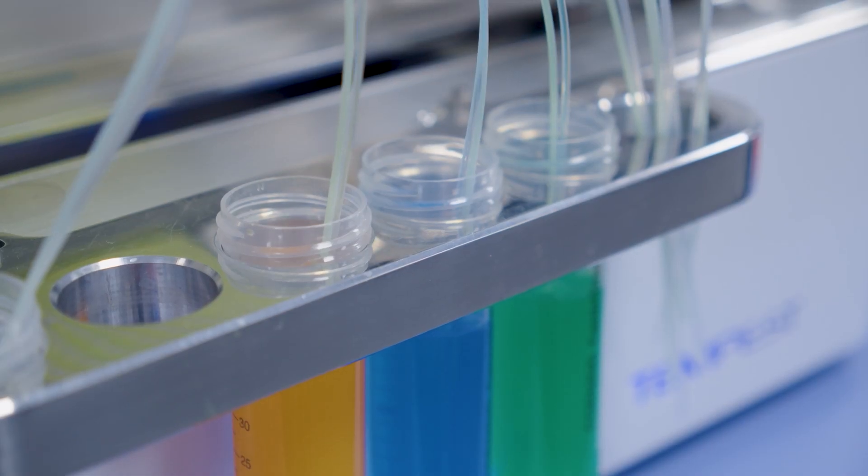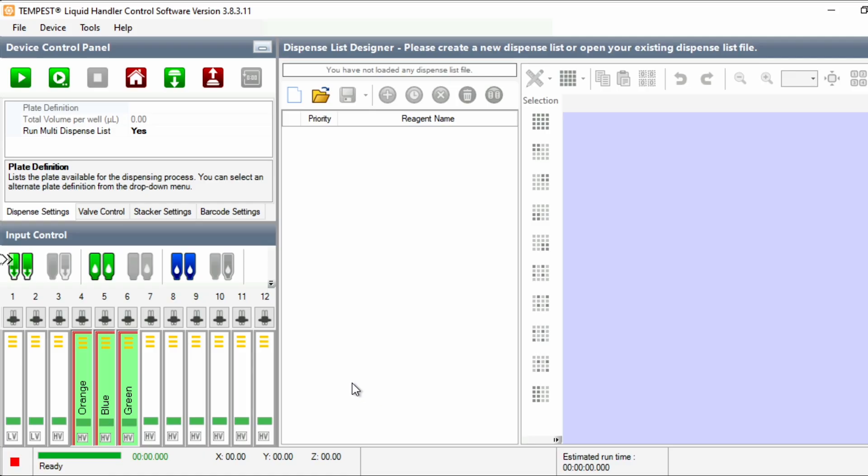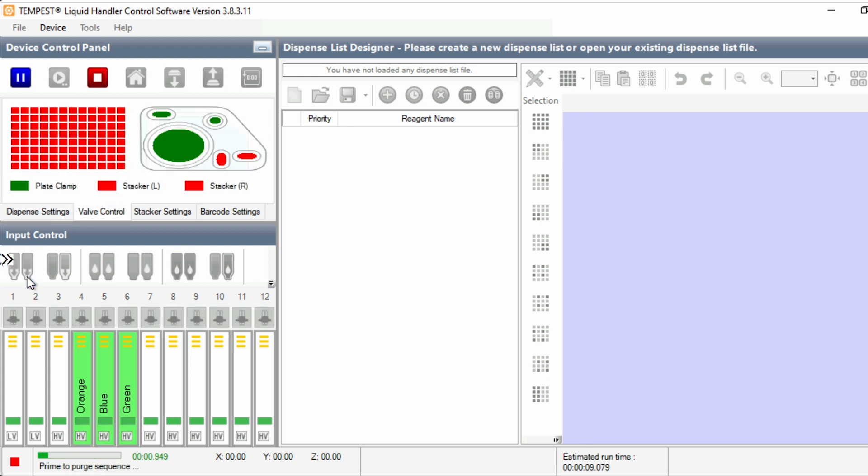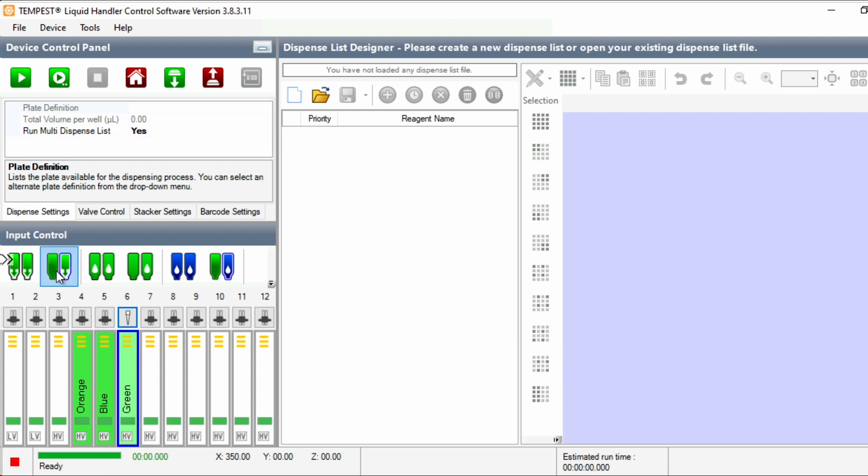When you're ready to run the execution, you'll first want to prime the lines with your liquid to ensure the chips are ready to dispense. To do this, click the Prime All button. If one of the lines doesn't quite look primed, once again click Prime All to ensure they're completely primed. If you're using a pipette tip as an input container, you can select it and click Prime Input to just prime this one chip.